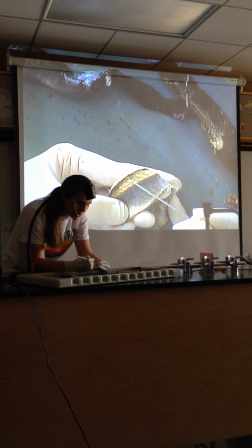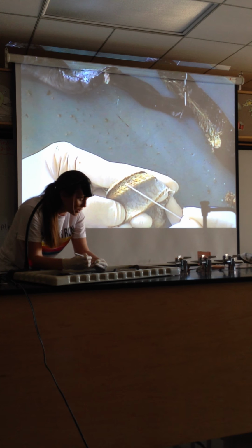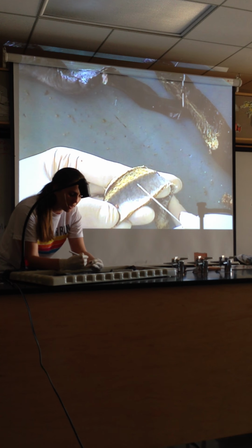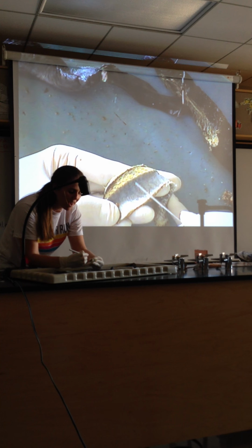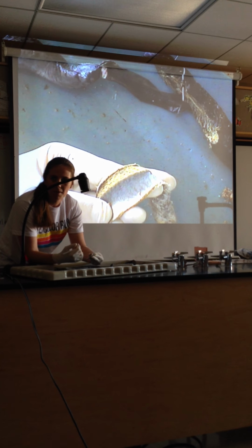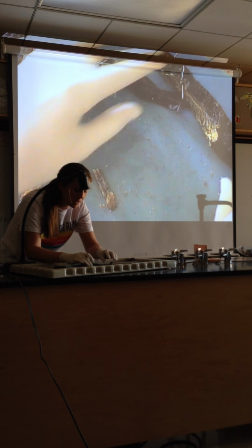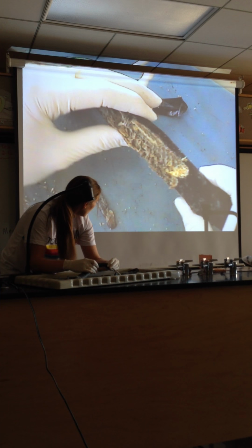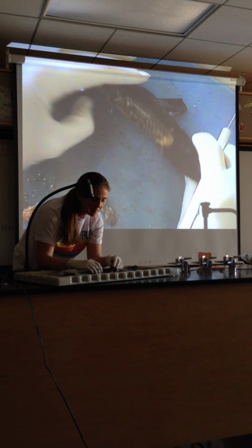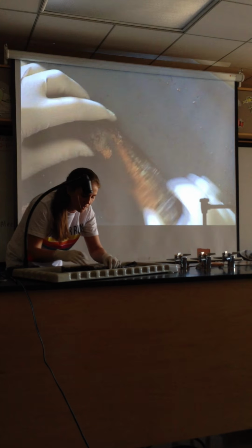So the little tiny lines that you see are the myoseptums because they're dividing it. You can see the myoseptums between this area right here, and the yellowish or creamy colored structure here is going to be the myotomes. In this area, the thicker bands are going to be the myotomes, and the thinner bands are going to be the myoseptum, because that's the muscles and its division. You can kind of see that, yeah, maybe not. You can't see that one there. All right, I'm going to take that out.